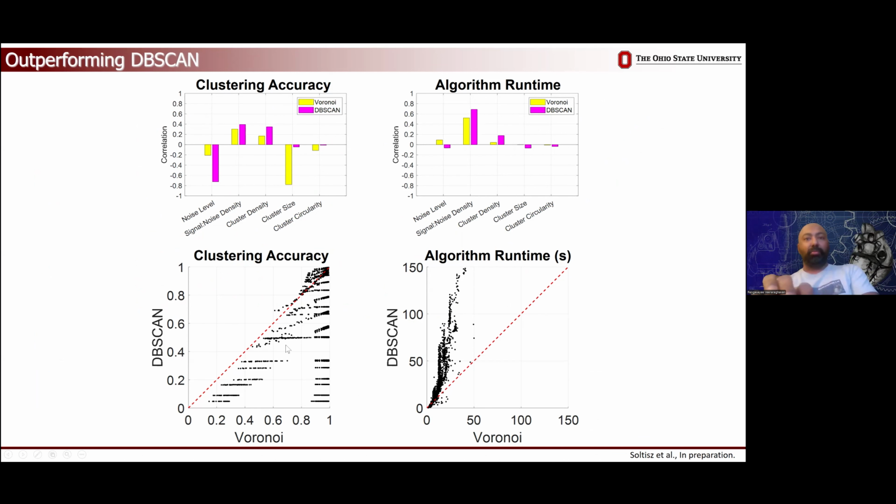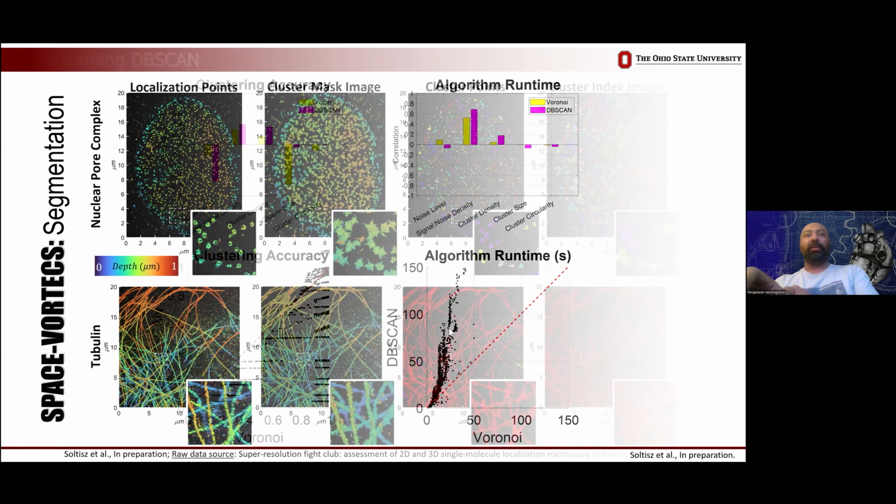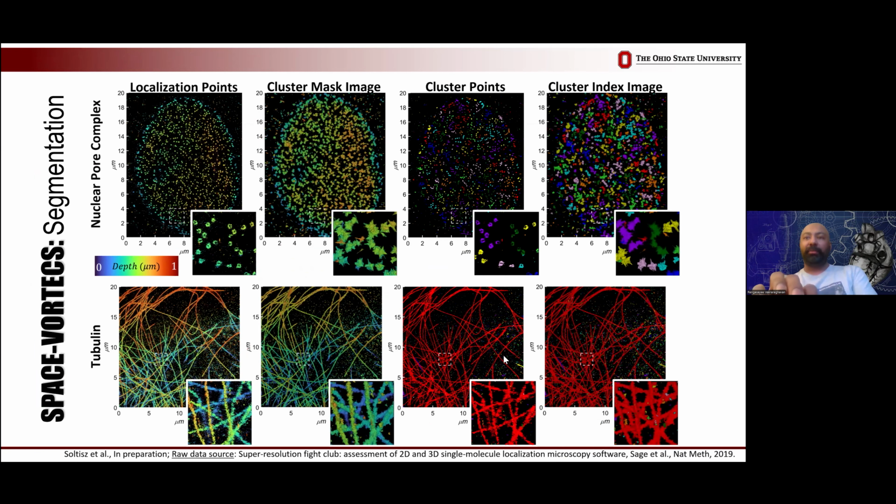And this method is more accurate across a wide range of data conditions. It's infinitely more efficient than previous methods. And it turns out it also segments all kinds of shapes really well. In this case, it grabbed the fibers pretty well. Not so much the nuclear pore complexes.